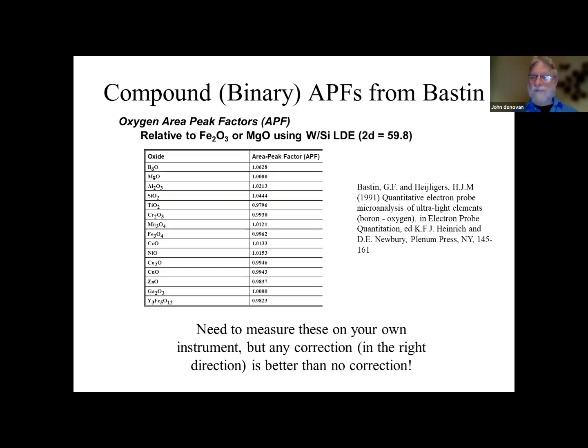So what do I mean by good? To get a worse correction factor is that the new crystals are much smoother. The smoothness of the layers between them is much smoother. So we actually have a higher resolution crystal, higher spectral resolution. But higher spectral resolution isn't everything. By having higher spectral resolution, we're more sensitive to peak shift and peak shape effects. So it's a trade-off. In fact, I don't know if any of you remember the old stearate crystals that we had, which were soap films basically deposited, those had even higher resolution, and the peak shape effects were even worse for those particular materials. But we don't use those anymore. So resolution can be a blessing and a curse.